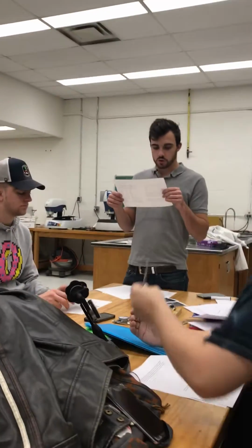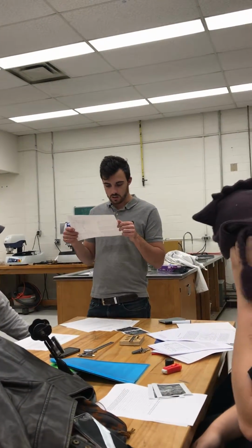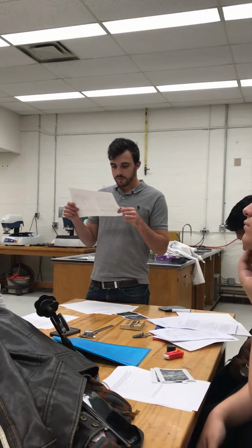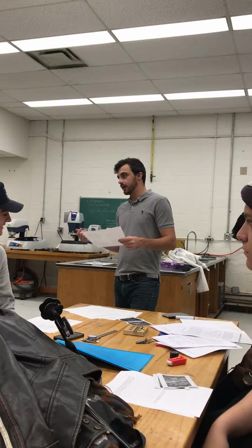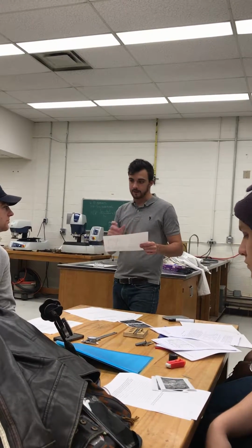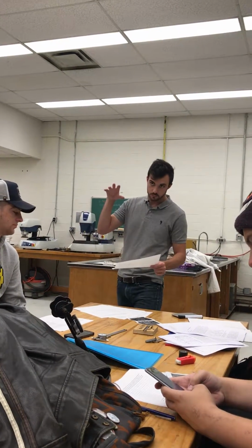So if I was to take a look at my annealed properties and my tensile strength of say 1020 through 1095 and I looked at the annealed values, I could go through the megapascals and find out whichever one I think is closest to my annealed tensile strength for those materials. Make sense? So once I've done that, I can take those values and compare them, and using that, I can identify what I think the sample is. Okay?